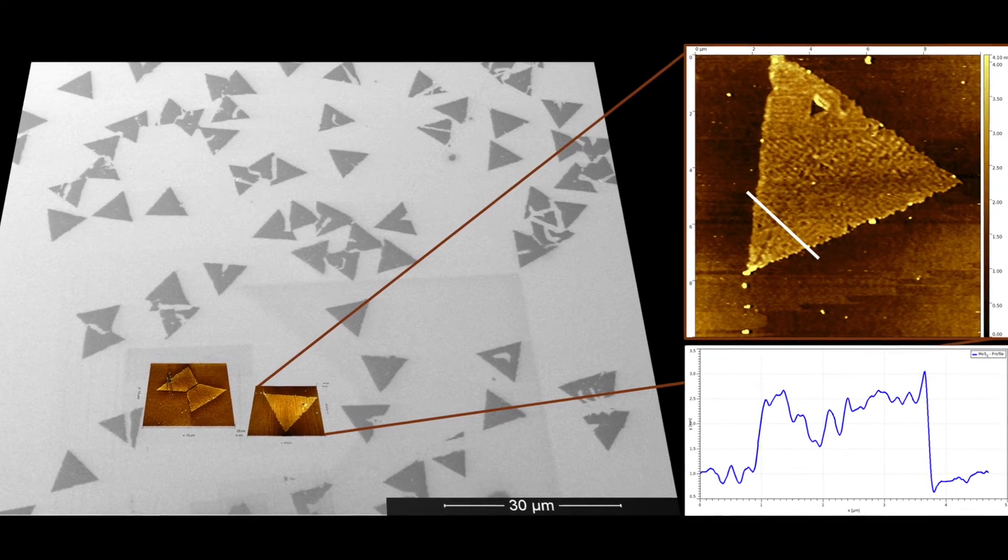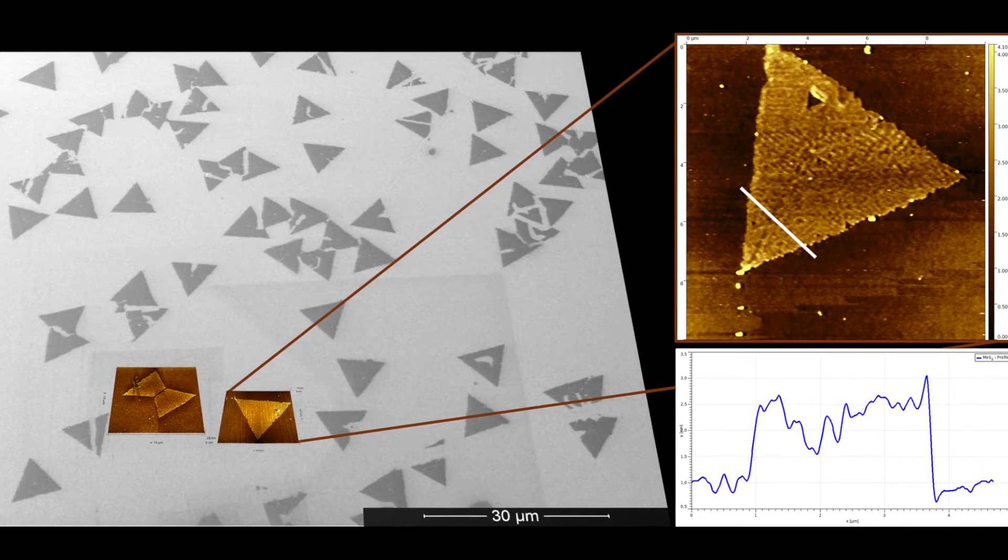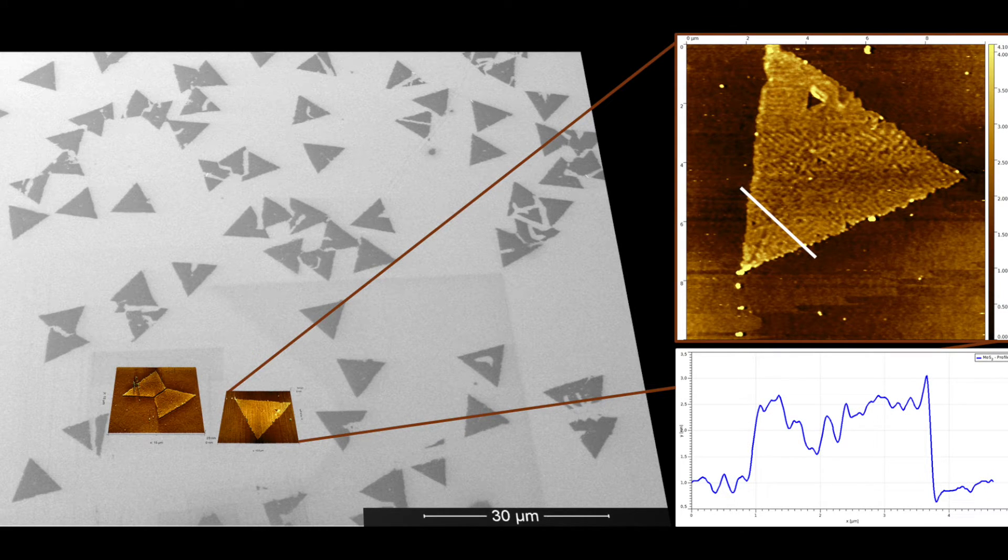This picture shows a unique combination of AFM and SEM. In this example we combine topology information from AFM with an SEM image and receive exact information about an atomic layer of molybdenum disulfide sheet having a thickness of less than 1 nanometer which cannot be measured using SEM. In this manner we obtain information about this material without taking the sample outside and we use the SEM to navigate the area of interest.